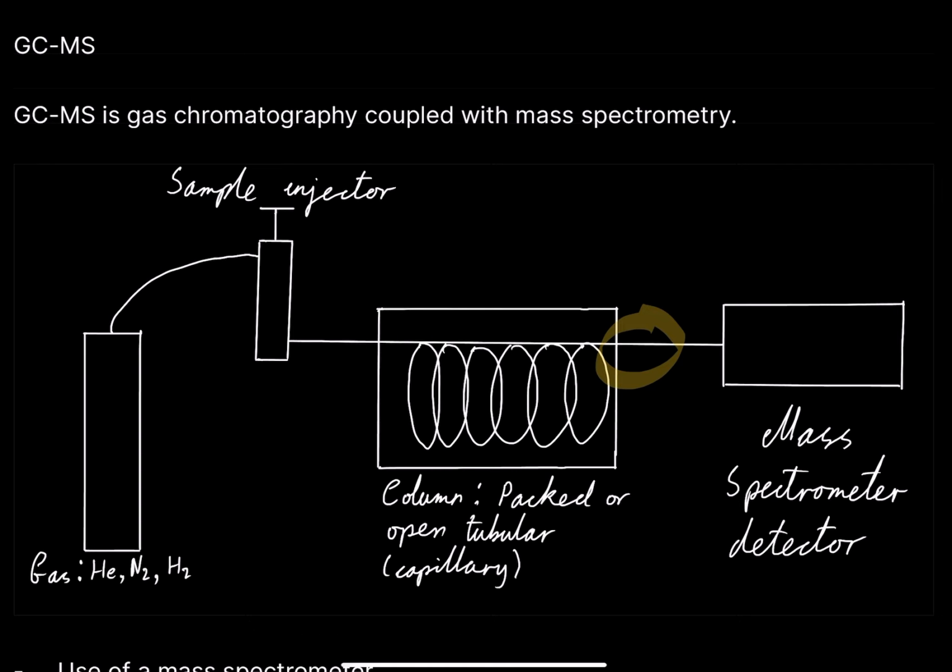What we've done here is that we've vaporized our sample, we've injected our sample, and that's a gas sample. That's a mixture now. And now we've separated the different compounds in that mixture of gases using gas chromatography, in the stationary phase of this column here. Hopefully you're following up to what I've got to now.